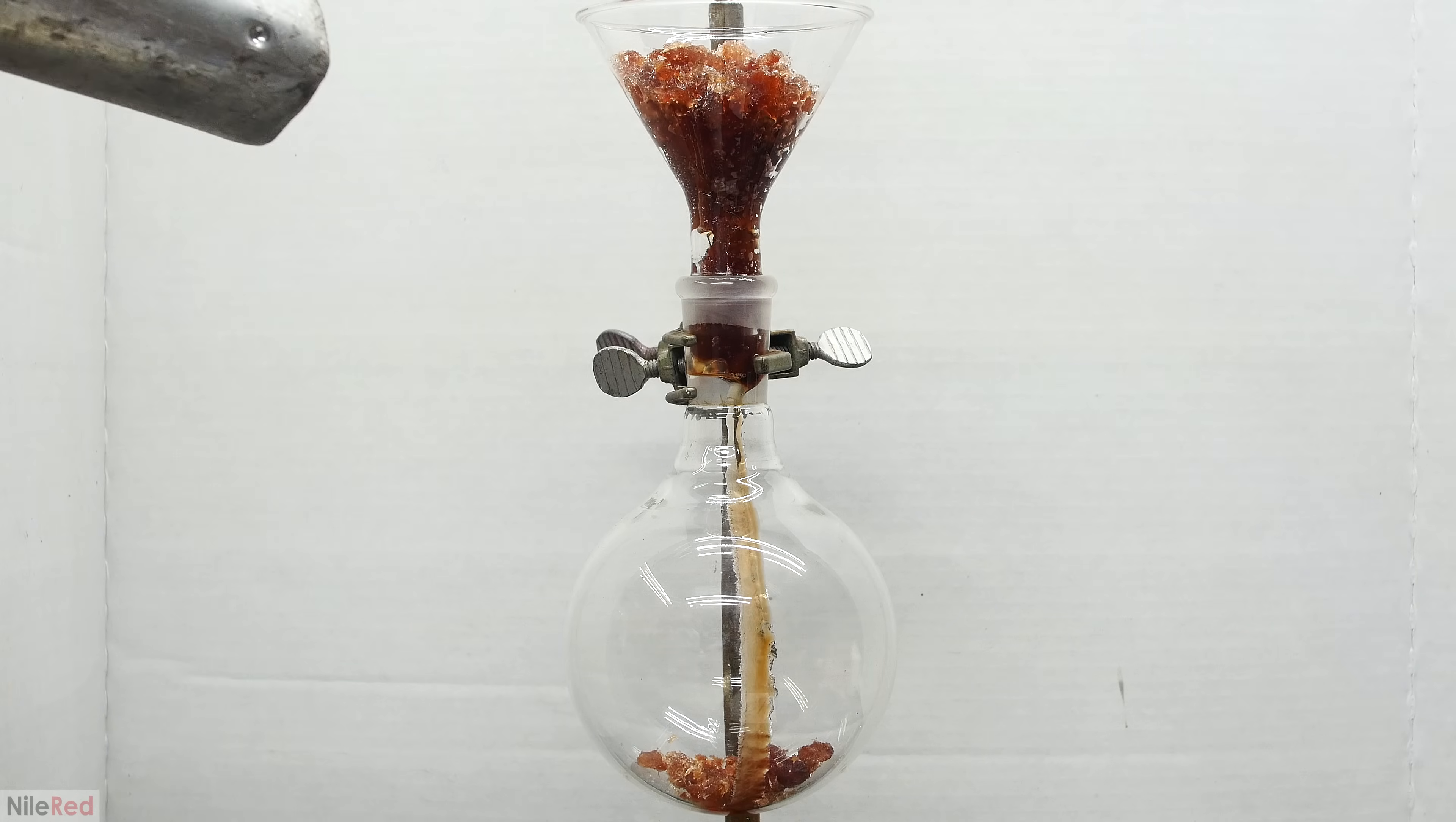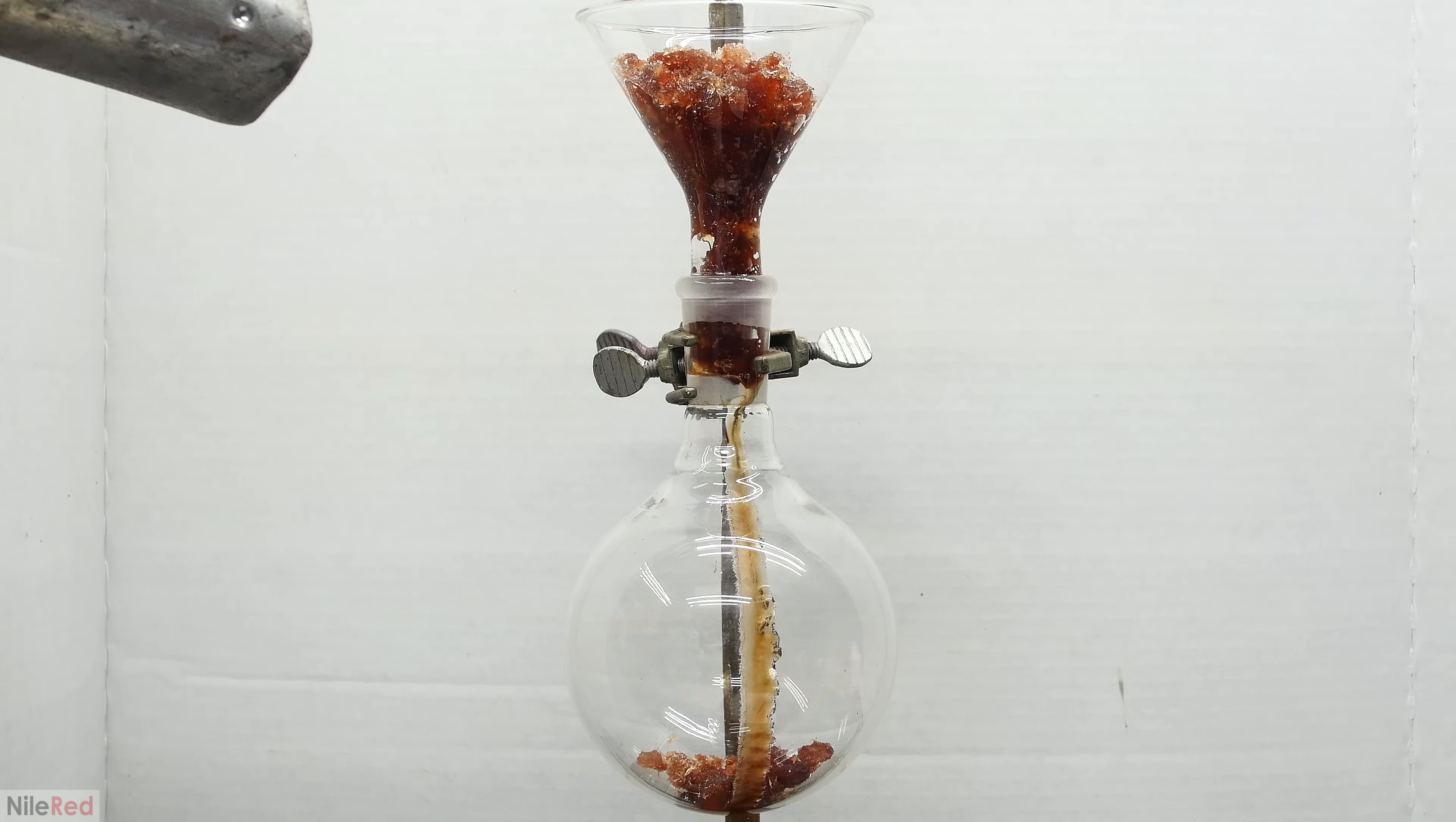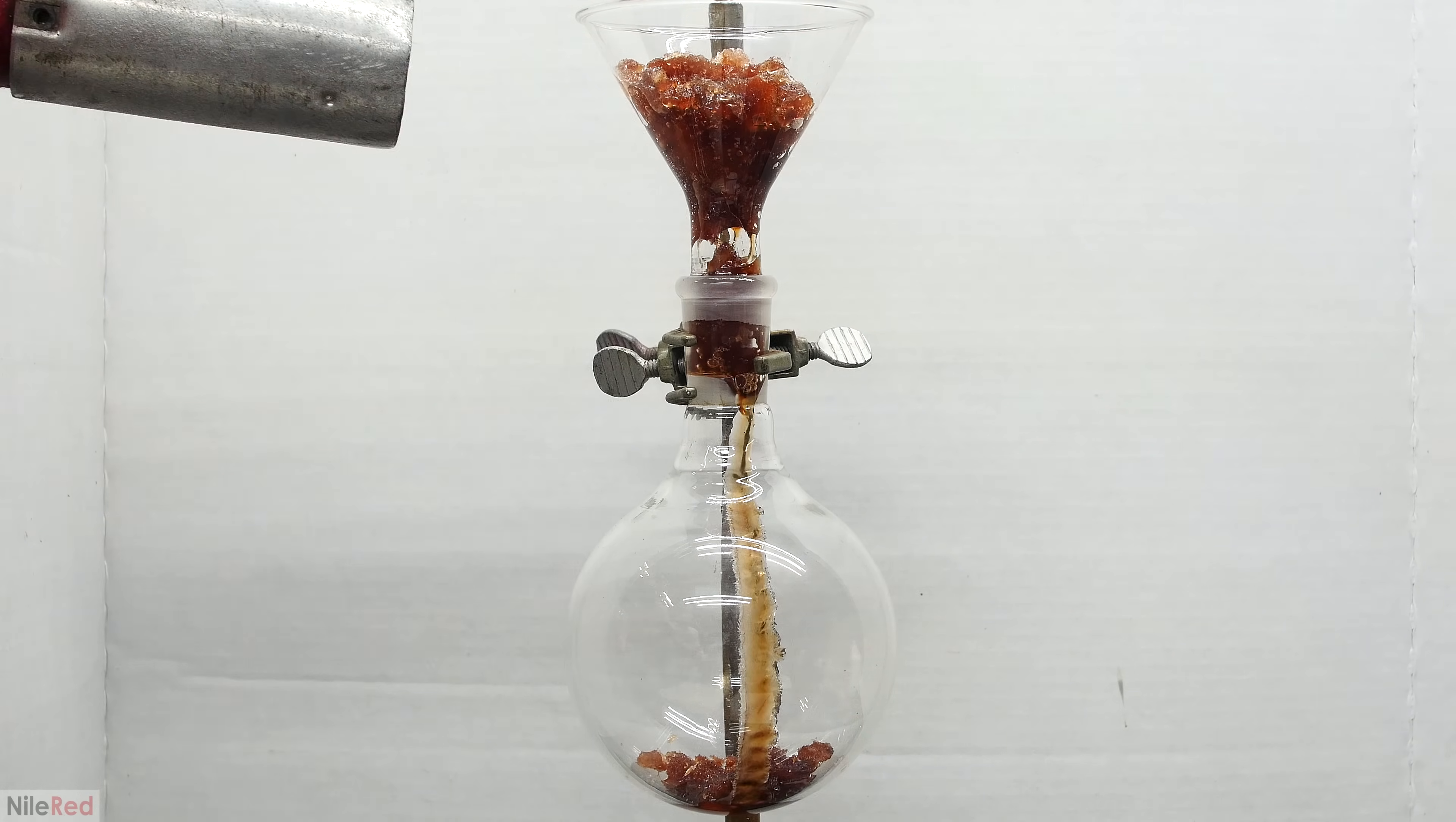I dumped the loose phenol into a glass funnel, and I blasted it with a heat gun to melt it. I didn't use a huge funnel, so I couldn't add everything at once, and I had to do it in something like three separate batches.